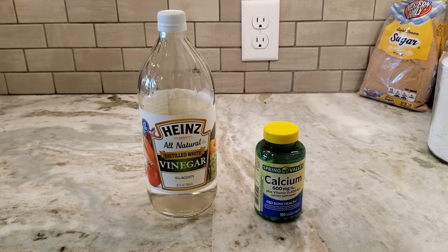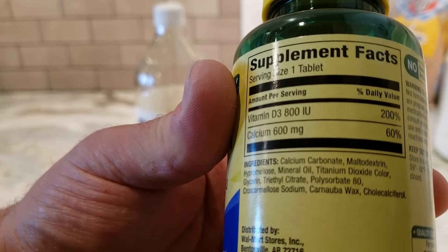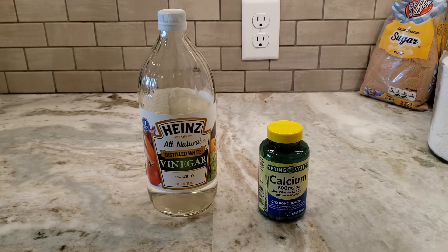To start out, there's only two things we're going to need to make the calcium acetate. First is a source of acetic acid — we're going to be using some five percent cooking vinegar, which may make some later steps a bit difficult because we're going to have to boil off a lot more water than if we were using a more acidic vinegar. But this is probably the best choice because it's the vinegar that everyone has sitting around their house. For our second ingredient we're going to need a source of calcium carbonate, and for this one I'm just using calcium pills that I picked up at Walmart. The number one ingredient is calcium carbonate, but after that we have maltodextrin and a lot of organics, so we're going to have to separate out the calcium carbonate from the organics before we can start making our calcium acetate.